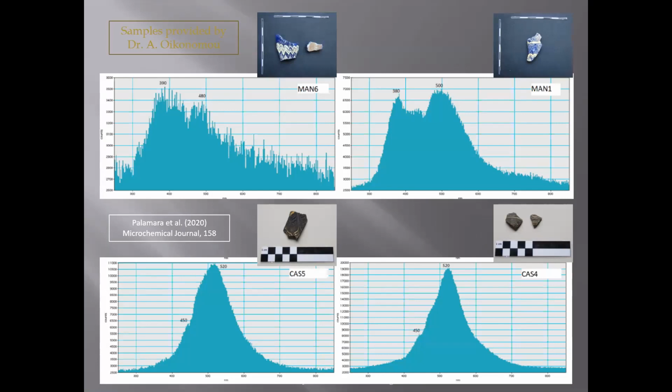We have only analyzed a small number of samples so far, originating from a small number of sites. So it's very early to say that this technique can work in all cases. However, it does have promising results, and it does show that there is a lot of promise there to identify between materials that seem to be chemically identical.